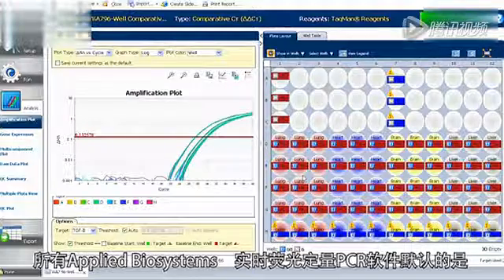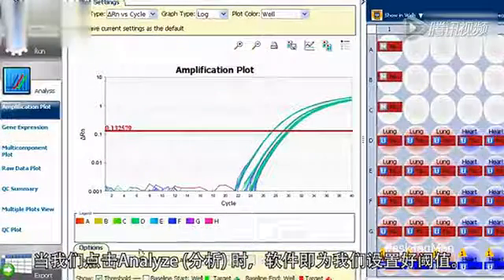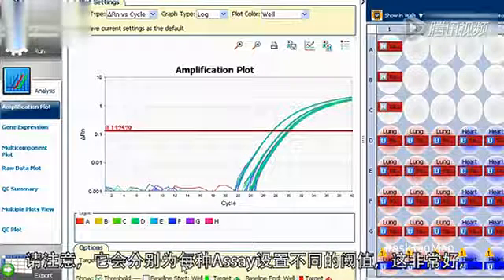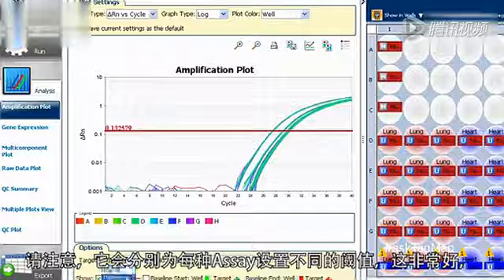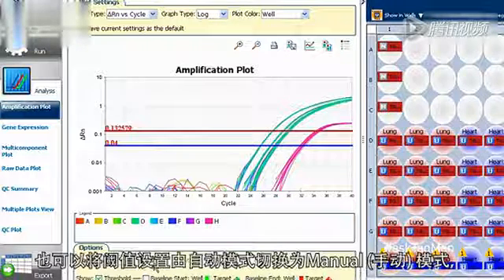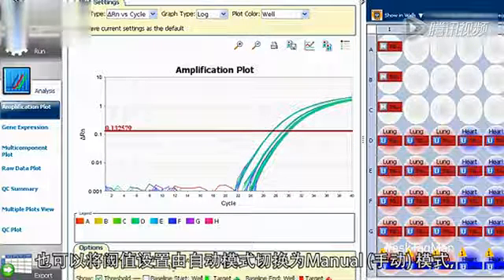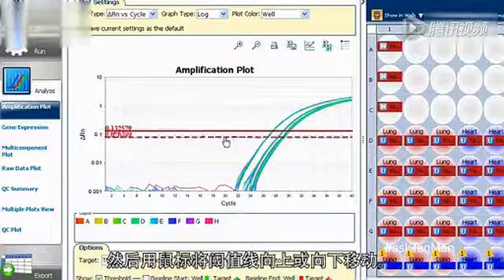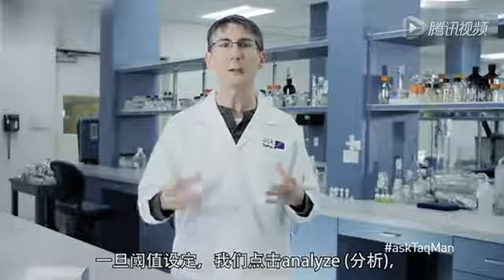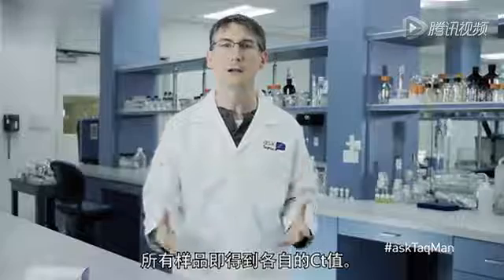The default on all Applied Biosystems real-time PCR software is auto-threshold, meaning the software sets thresholds for us the second we click Analyze. Notice that it sets a different threshold for each assay separately, which is good since not all assays have the same sweet spot. If I want, though, I can switch any one or all of my thresholds to manual mode, then move the line up or down with my mouse. Once the threshold is set and we click Analyze, all the samples get their respective CT values.